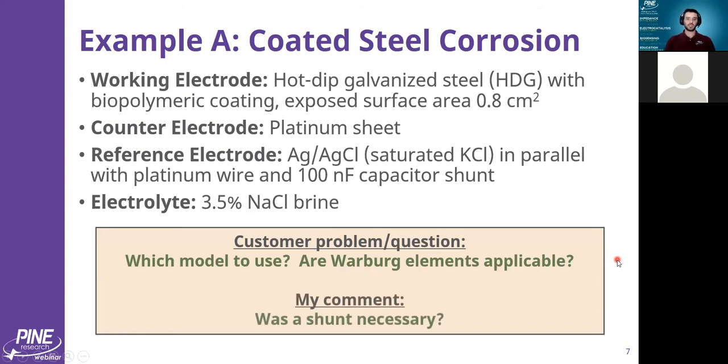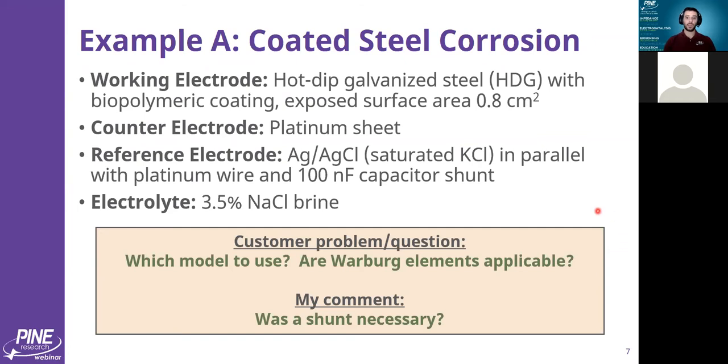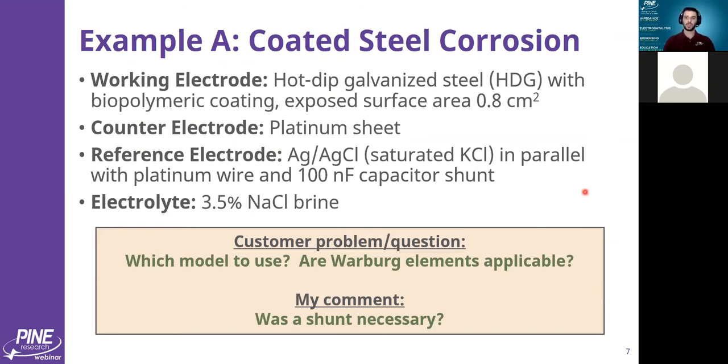And my comment back to this person was whether a shunt was necessary. I don't have an answer to that question, actually. Their data looked quite good. It was very valid impedance. But without seeing data without the shunt compared to with the shunt, it's hard to know if the shunt was actually necessary. If you're getting data yourself and you're not sure if you could fix the high frequency points, you might be able to try adding a shunt and see if that helps things.